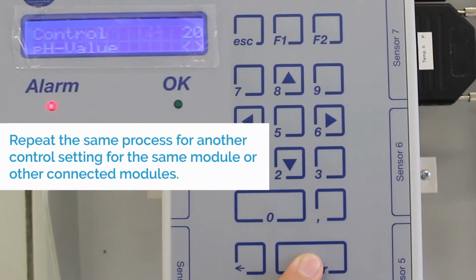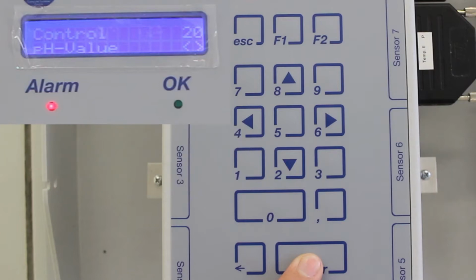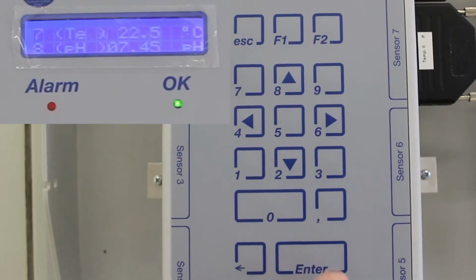You can now allocate different control settings to other sockets using the same pH module or a different module connected to IKS Aquastar. Once everything is set, go back to the main menu level and select Run. The OK LED light should turn on. The display will show first the time and date.